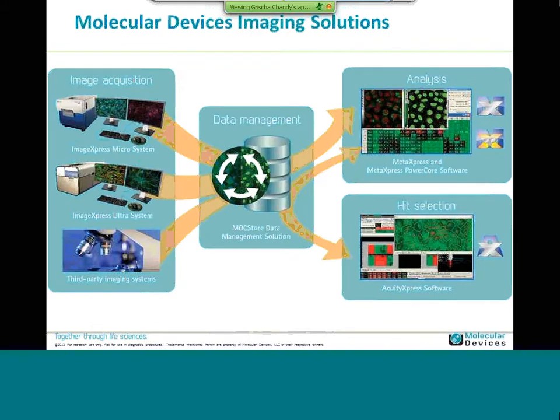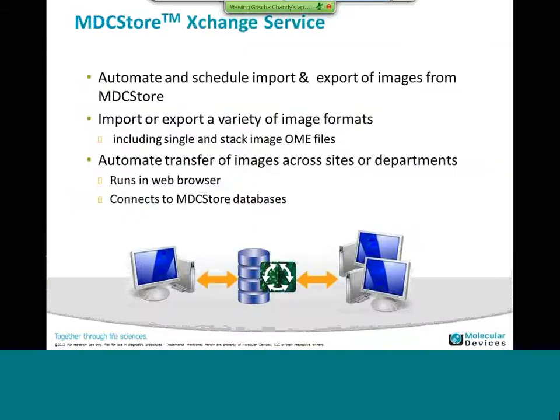Also, I wanted to just remind you of a couple of other things that are new. I mentioned that you can import third-party images into our tool. This is a new tool that allows you to automate and schedule import and export of images from MDC Store. There's a number of formats that are compatible. A number of TIFF formats are easy, OME files, and there's a list of file formats that can be imported. And it automates the transfer of images across sites or departments. It runs through a web browser, it connects to the MDC Store database, and you can schedule and automate the movement of these images into and out of our database.